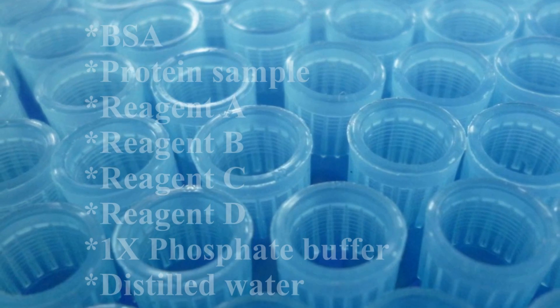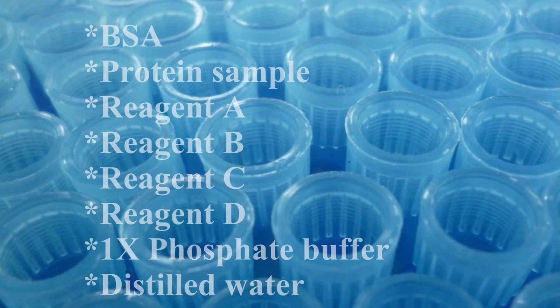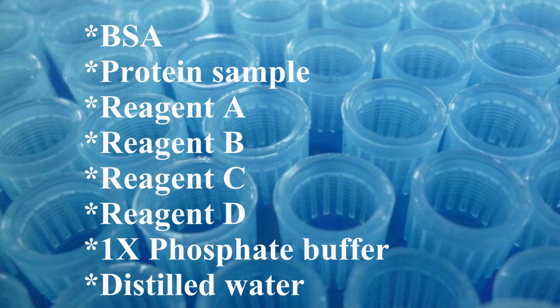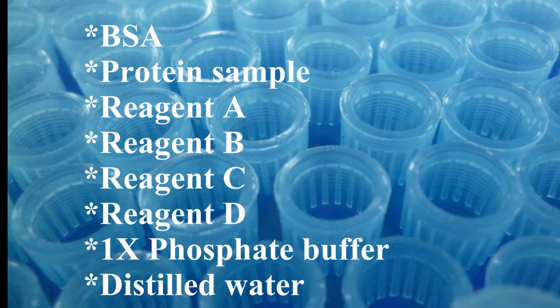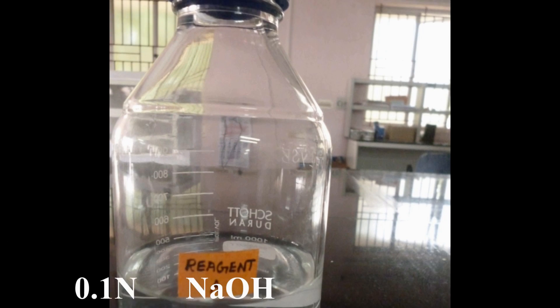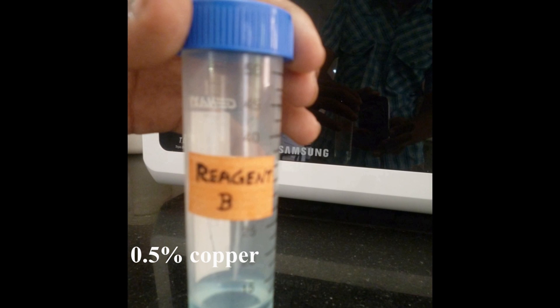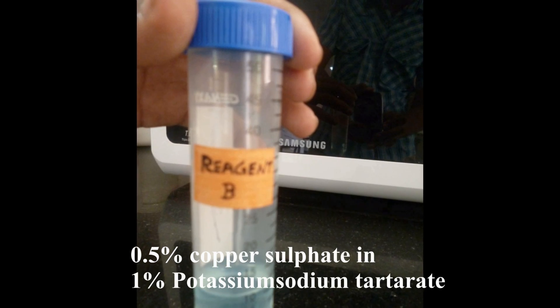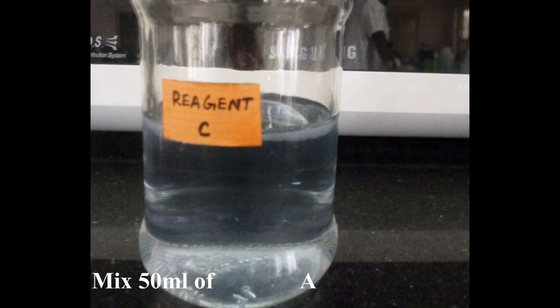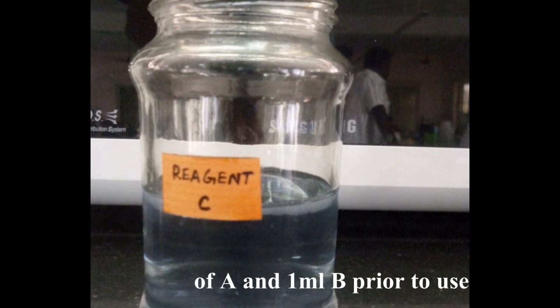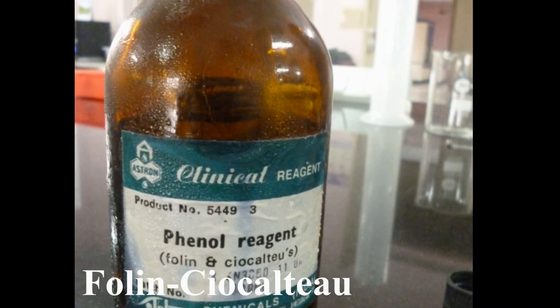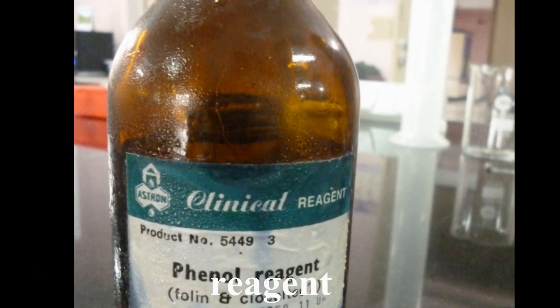The reagents required are BSA, protein sample, reagent A, B, C, D, and 1x phosphate buffer and distilled water. Reagent A contains 2% sodium carbonate in 0.1N sodium hydroxide. Reagent B contains 0.5% copper sulfate in 1% potassium sodium tartrate. Reagent C is an alkaline copper solution made by mixing reagent A and B. Reagent D is the Folin-Ciocalteu reagent.